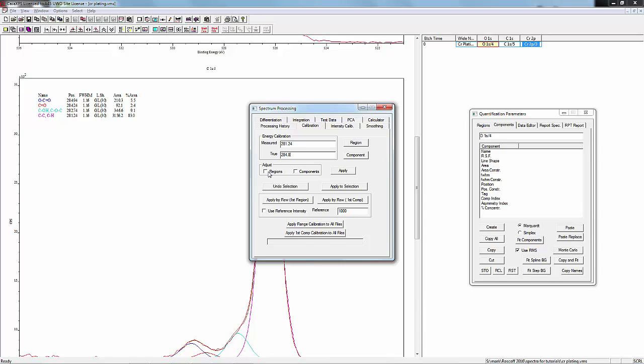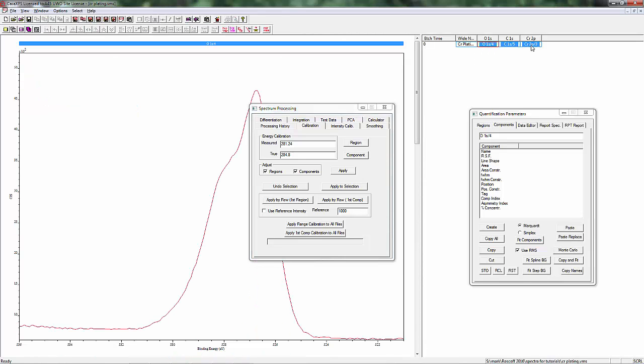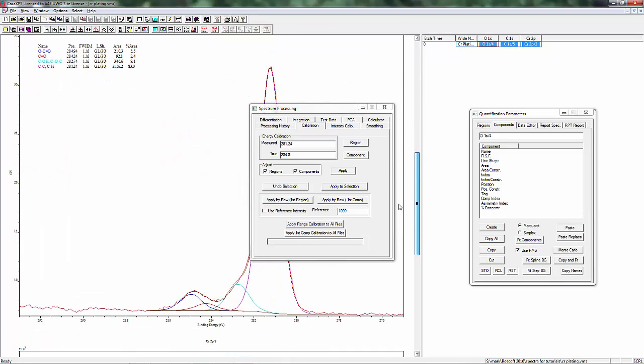As long as you report what value you're using in your publication or your thesis, then that'll be okay. Whichever one you choose, they're both acceptable. We're going to adjust Regions, Components, and we're going to Apply to Selection so that should get all these. I'm going to make sure this is all on and we're going to hit Apply.